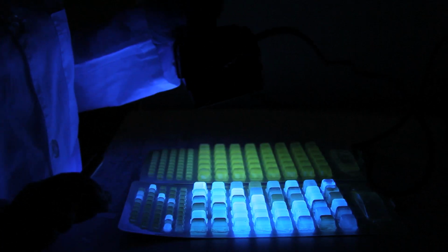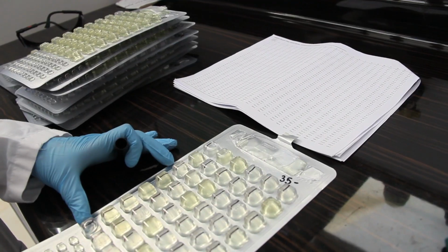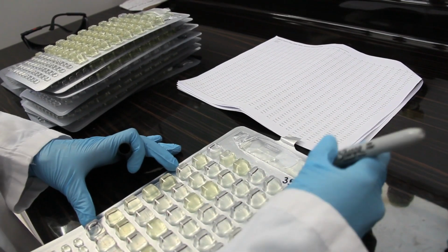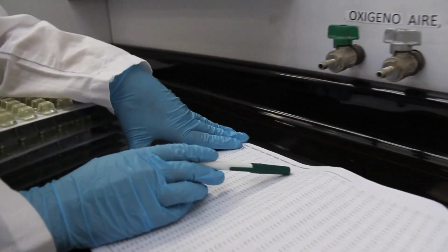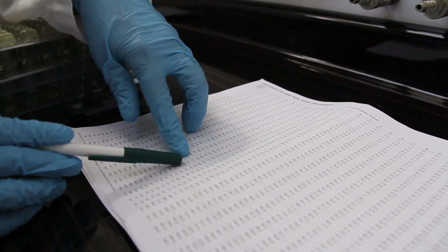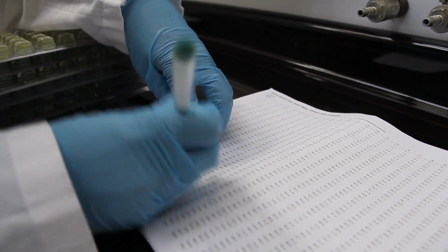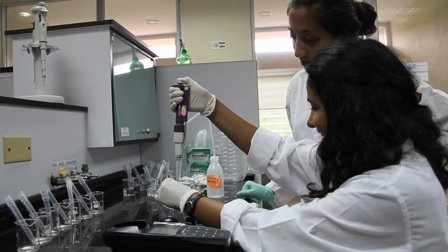Right now, we're looking at the wells that light up with the UV light. This means that there is presence of Enterococcus or fecal coliforms within the water sample that it was taken from. Then we look at this sheet and find the number 7 of small wells and join it to the number of large wells, which for this is 70, meaning that this is the number of colony forming units within that sample.